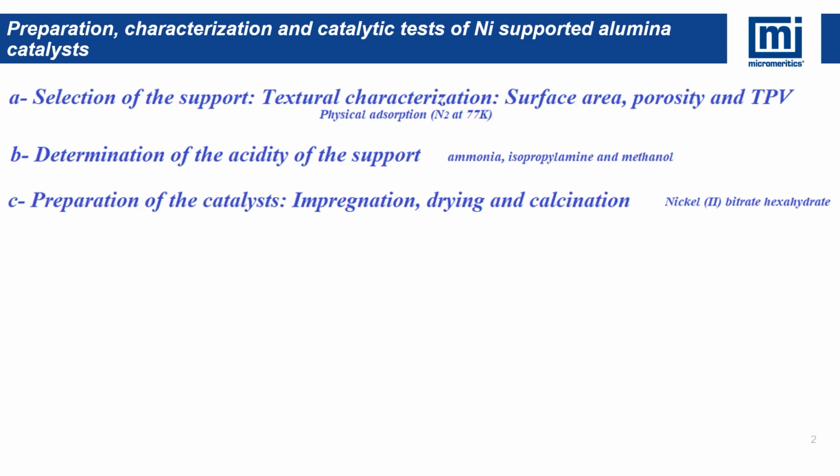One is a very high surface area support, and the other one is a low surface area support, because we wanted to see the effect of the surface area of the support on the activity of the catalyst. Then the impregnation is just incipient, dry. We use this as the solution. Of course, the support was activated first, which was degassed at a temperature of 200 degrees C under vacuum. Then it was cooled down under inert gas, so it will not reabsorb the water from the atmosphere.